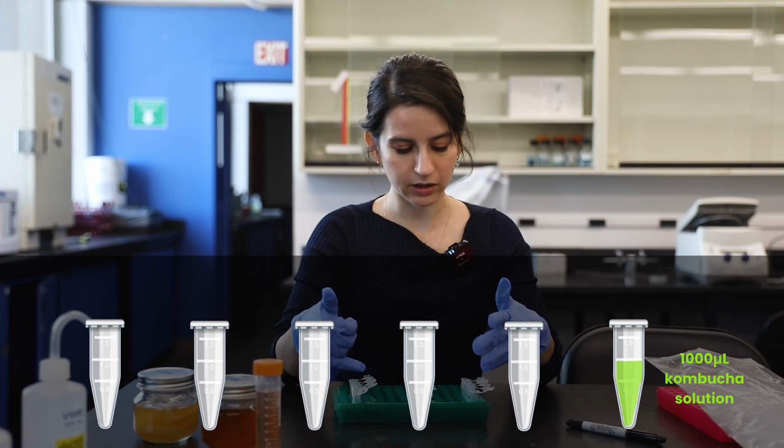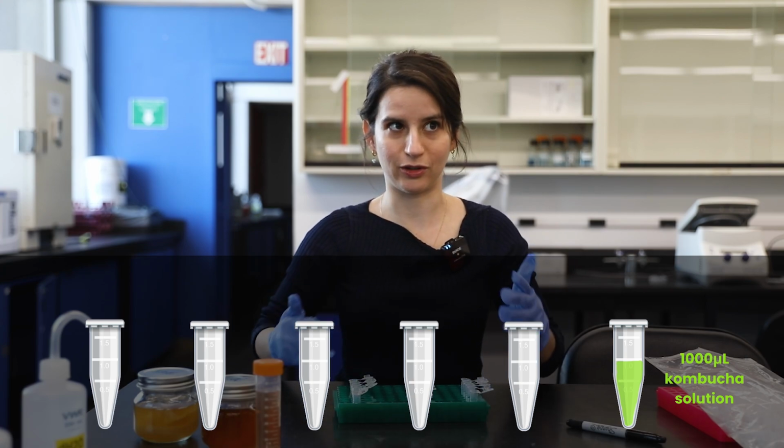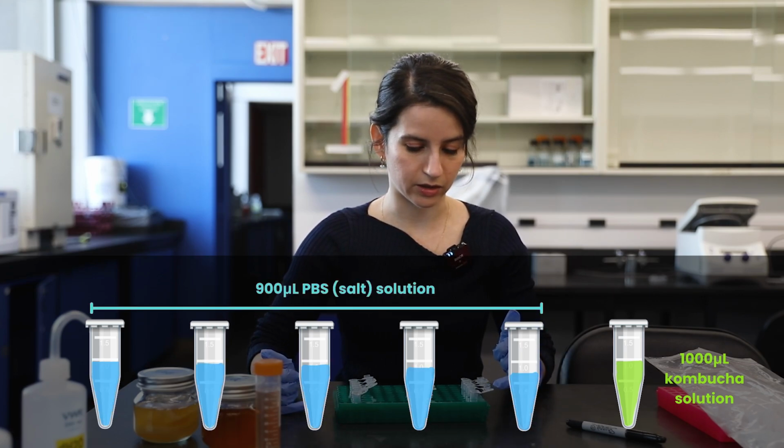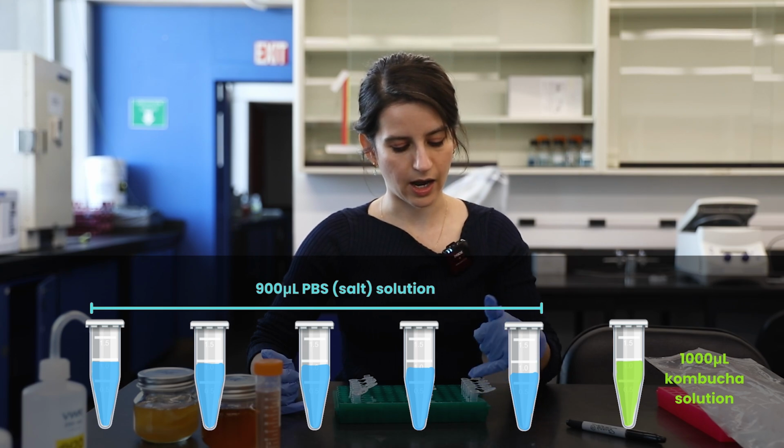I'm going to start there and do 10-fold dilutions all the way across. So I'm going to add 900 microliters of my PBS into all of these tubes, and then, as I dilute it down, add 100 microliters.